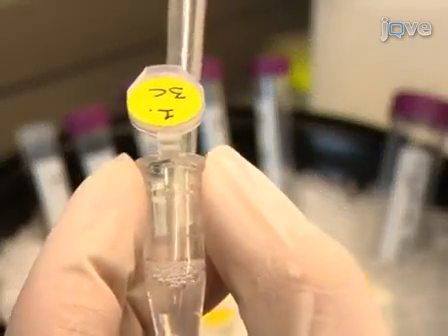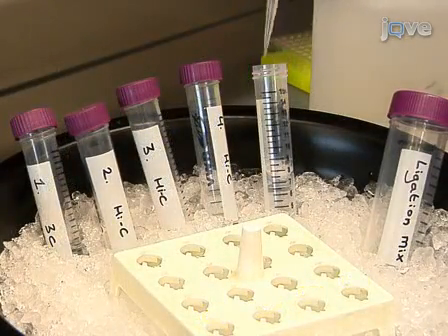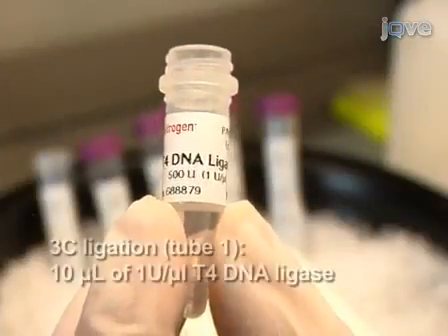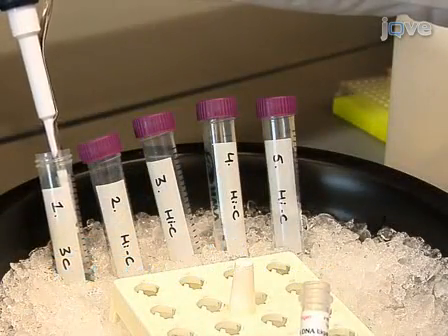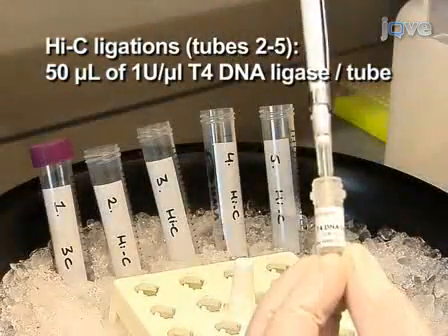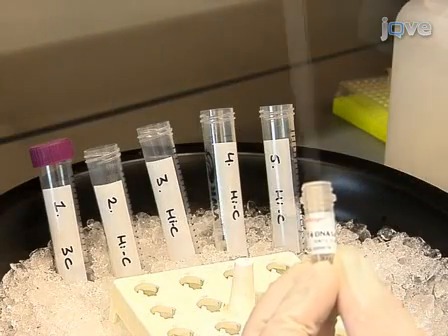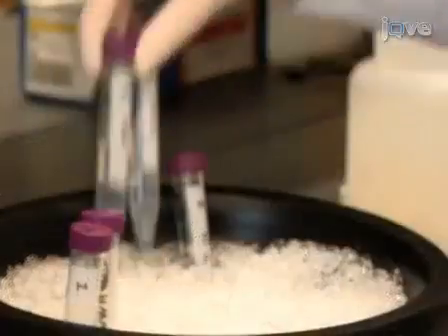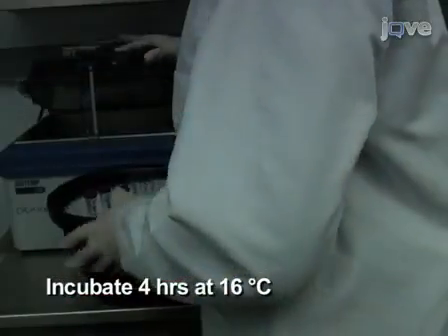Then, transfer each digested chromatin mixture to the corresponding tube. Add 10 microliters of T4 DNA ligase to tube 1 to perform a regular 3C ligation. Then, add 50 microliters of T4 DNA ligase to tubes 2 to 5 to perform blunt-end Hi-C ligation. Mix the tubes by inverting them and incubate for 4 hours at 16 degrees Celsius.